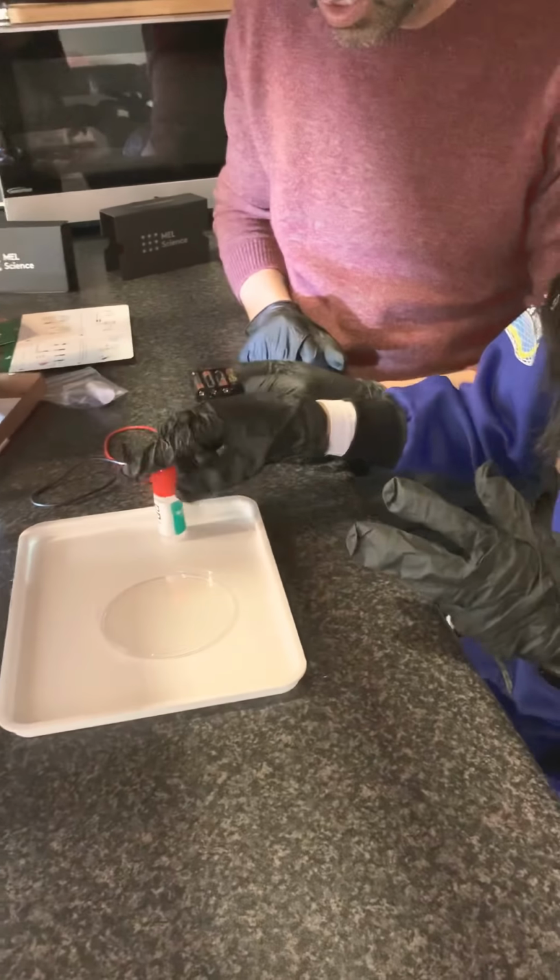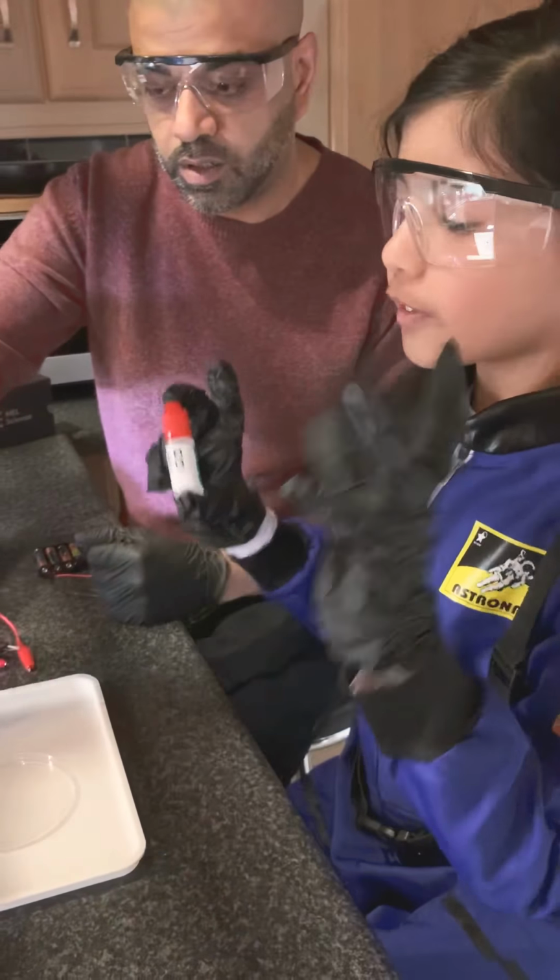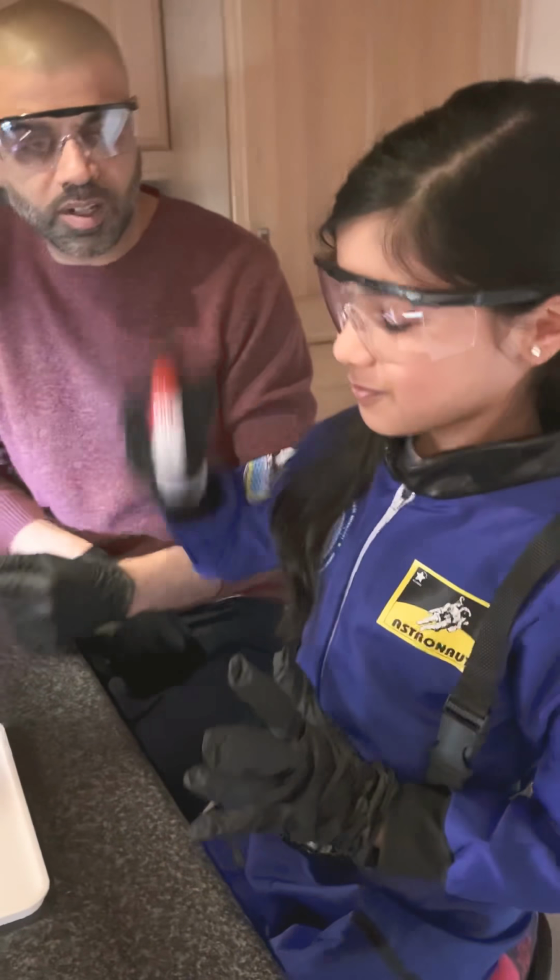Now you must shake this bottle for 20 to 30 seconds. So we are going to start the timer in 3, 2, 1, go.